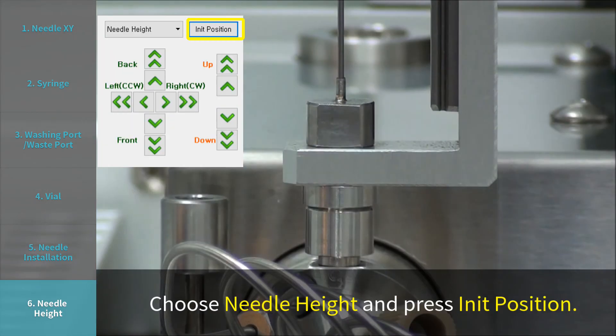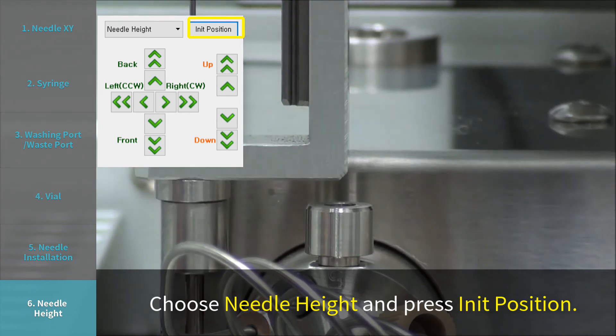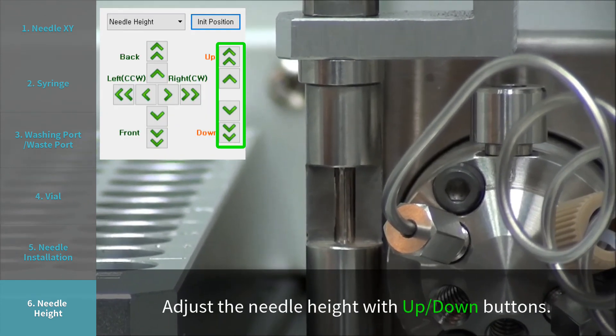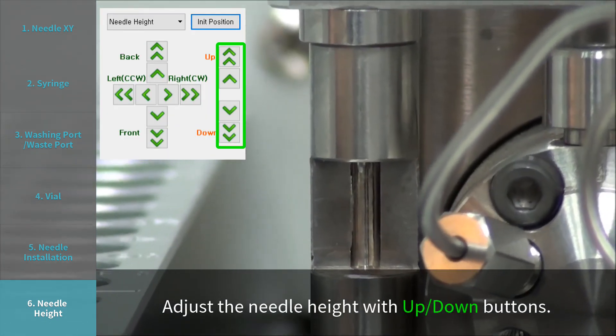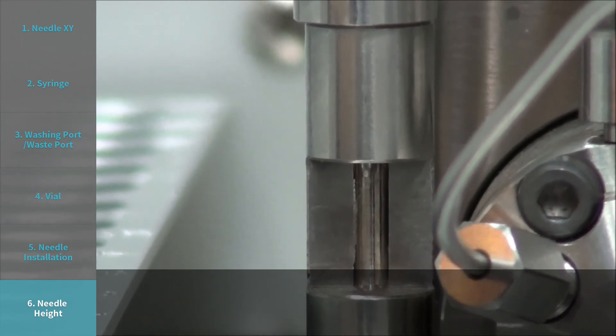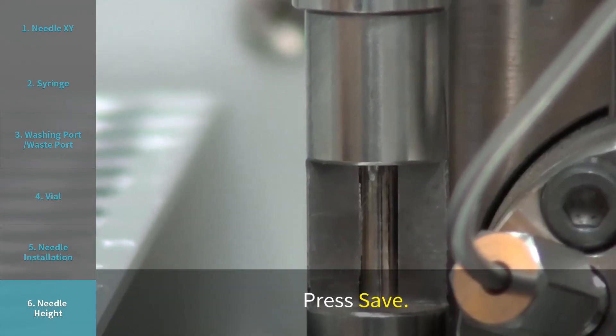Step 6: Needle height. Choose needle height and press INIT position. The needle locator moves to the adjustment pole next to the injection port. Adjust the needle height with up and down buttons. The tip of the needle should be 1.5 to 2 mm below from the indicated point. Press save.